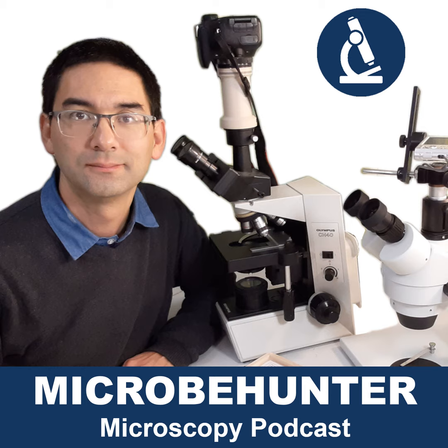You just take your coins or your stamps or your flowers, and you put them directly under the stereo microscope, and you can look at them, okay? And you can document them using photographs and whatever. So it really adds a lot to some of the existing science hobbies that you might already have, okay? Or if you're into old books, let's say, or old texts, and you would like to look at the print in more detail, and you have been using a magnifying glass so far, maybe you can also use a stereo microscope, okay? So that is one of the reasons: an extension of an already existing hobby.